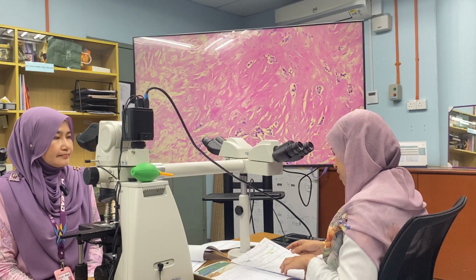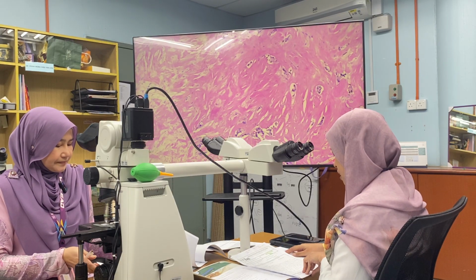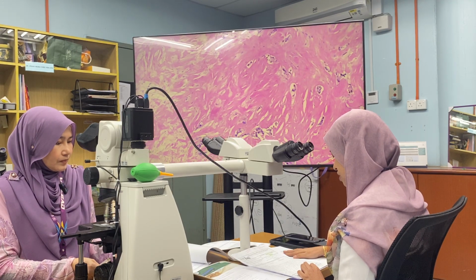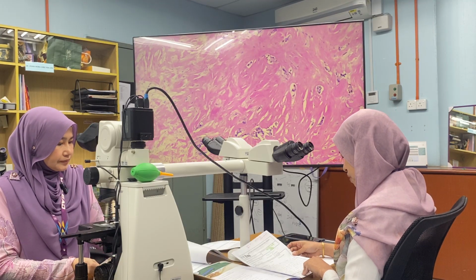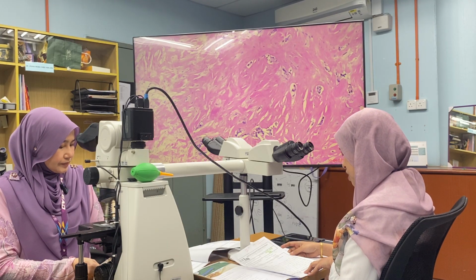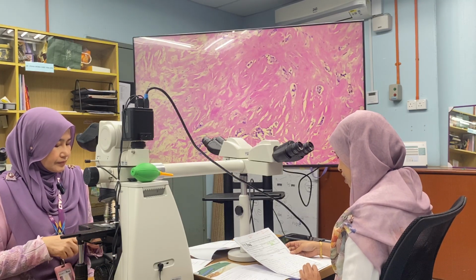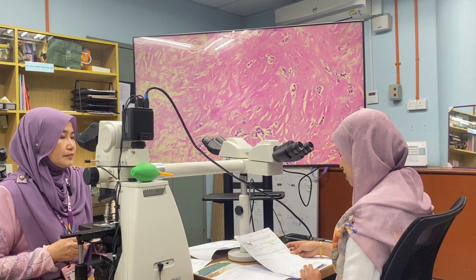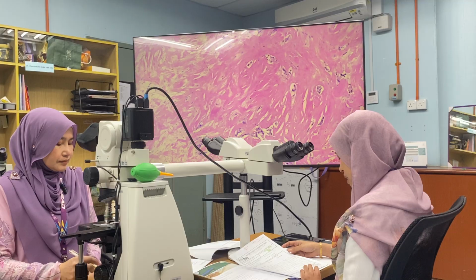So I received a left breast mastectomy specimen weighing 250 grams, tagged with one short suture as superior and one long suture as lateral, measuring 165 x 150 x 55 mm, with nipple-bearing skin on the superficial aspect measuring 105 x 90 x 5 mm. There is a well-healed scar on the inner upper quadrant measuring 20 x 10 mm.